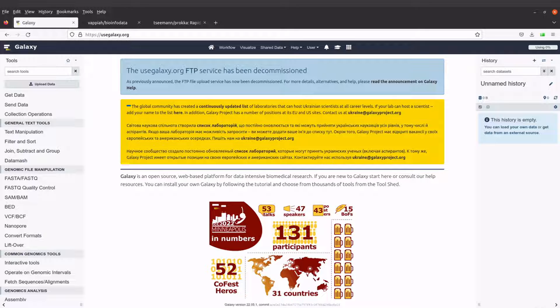Hi everyone, welcome back to another episode of the tutorials on Galaxy for bioinformatics. In today's video I'm going to show you how you can perform genome annotation using the Prokka tool.